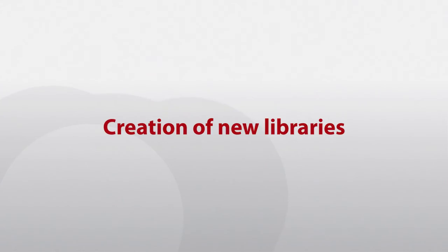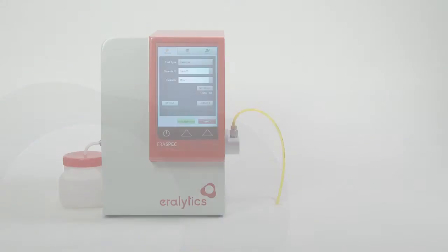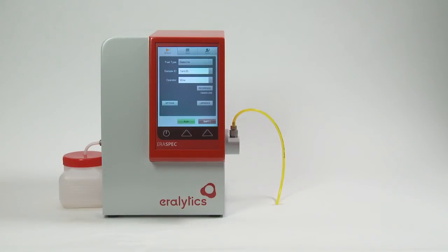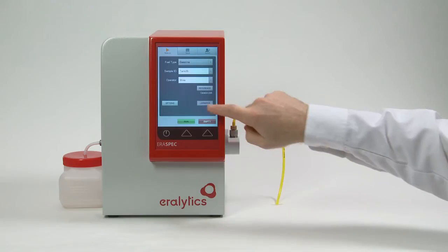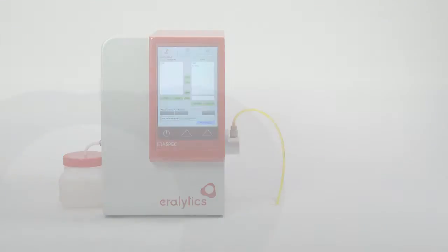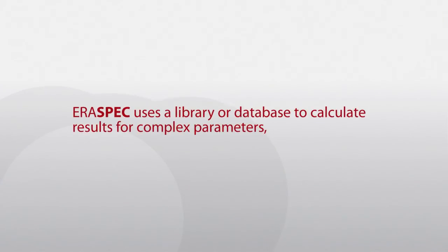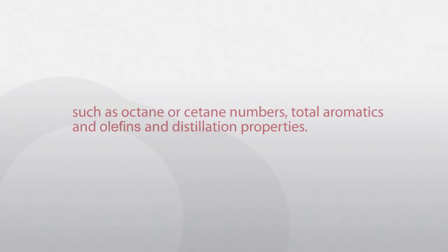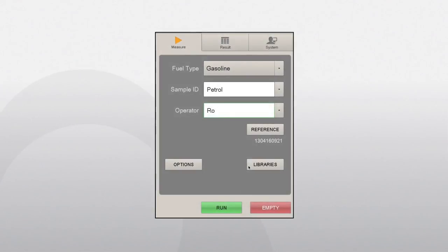Creation of new libraries. To create new libraries, go to the Select Libraries option in the Measure menu. AeroSpec uses a library or database to calculate results for complex parameters such as octane or cetane numbers, total aromatics and olefins and distillation properties. The libraries store the spectra of typical samples together with the known values of these parameters as determined by the respective reference methods.